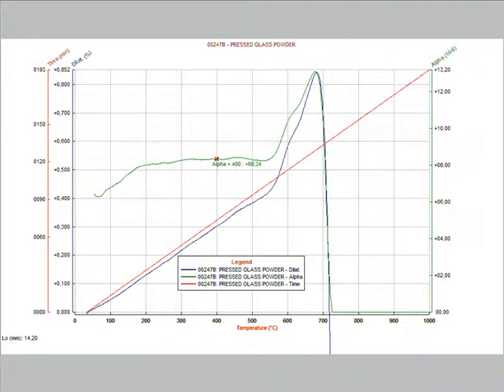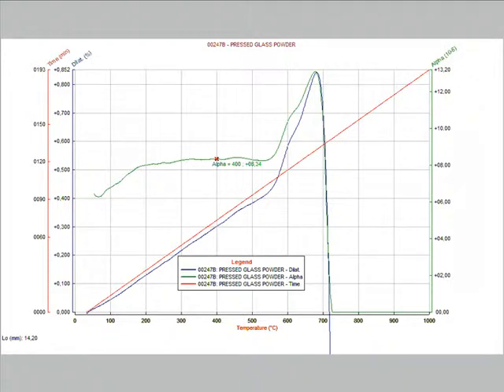Zooming on the upper part of the curve, we get a curve similar to the one obtained with an electronic dilatometer. The transition temperature is 540 degrees and the thermal expansion coefficient is 8.4 by 10^-6. The differences with the curves from traditional dilatometers are quite obvious.